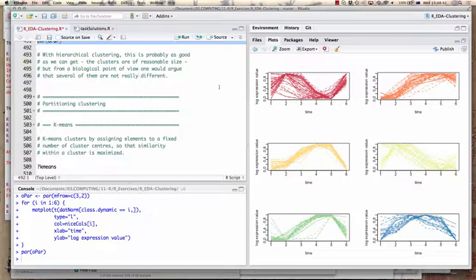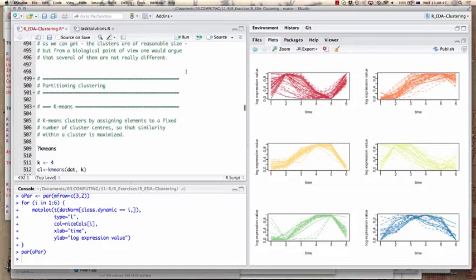Working on normalized data with dynamic tree cut is probably as good as you can get with hierarchical clustering. The clusters are now of reasonable size, but from a biological point of view, I still wouldn't argue that some of them are really distinct.